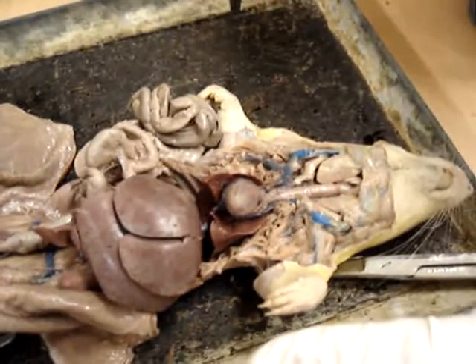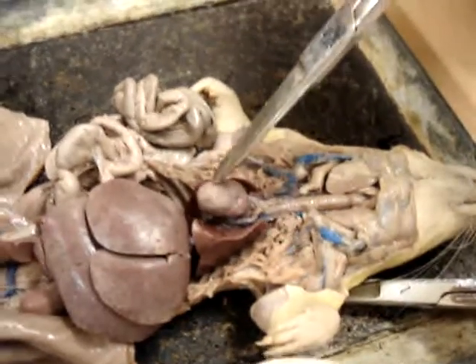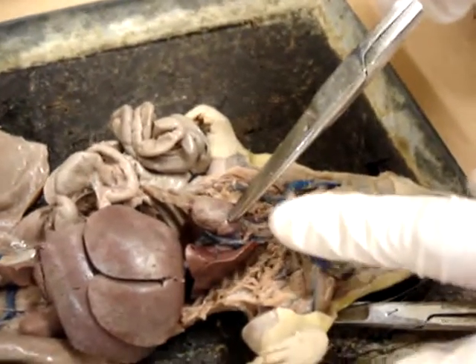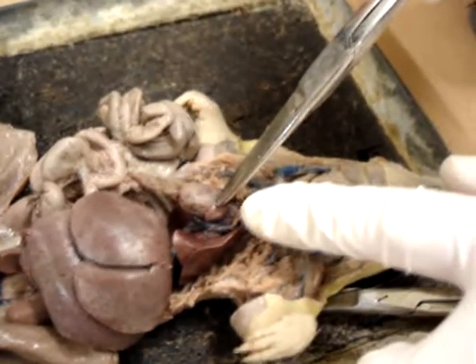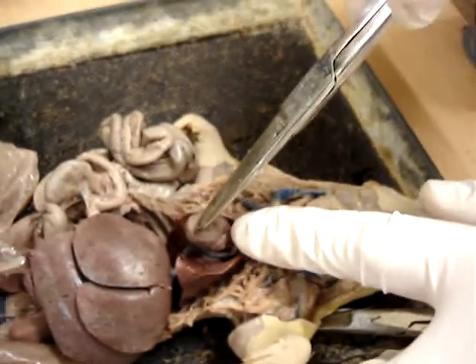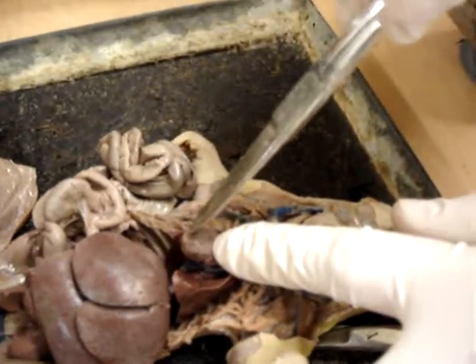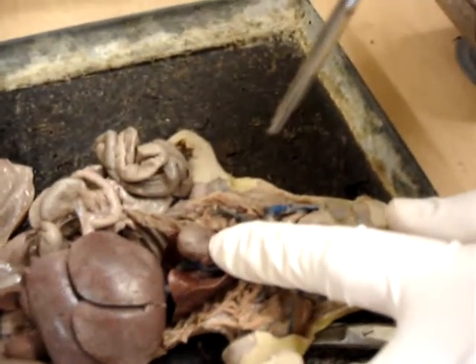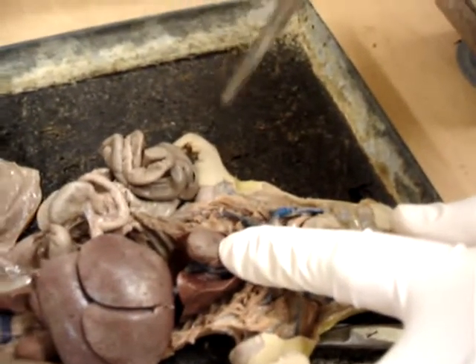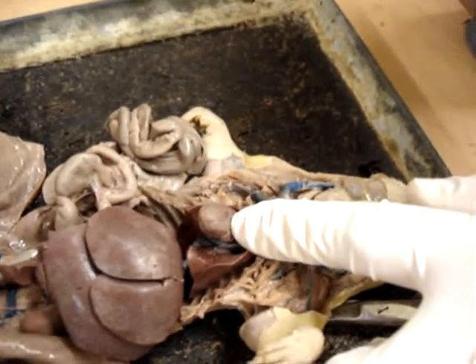Heart anatomy: this is the heart here. The upper part of the heart is what we call the auricle or atrium. The ventricle would be toward the bottom of the heart — those are the ventricles. We can ignore the major arteries and major veins and move on to the second part, which is the respiratory system.